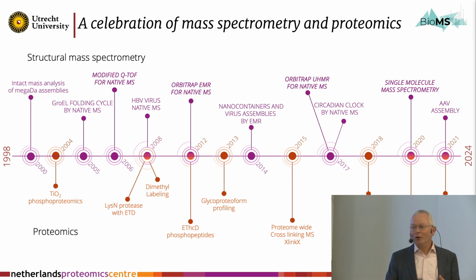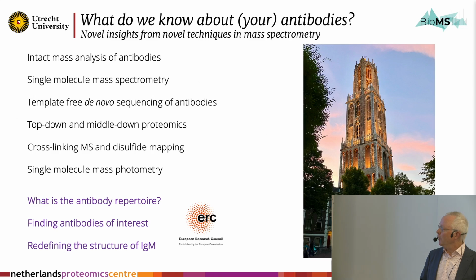But you know, this development of technology brought us further into our applications. Now, I will not talk about all this. I just want to focus on this last part where we are now, where we got really into this research on antibodies. But what I still want to say, we only got there because we developed new methods to analyze antibodies, also to do mass spectrometry on single molecules. So this is about 1 million times more sensitive than we could do before.